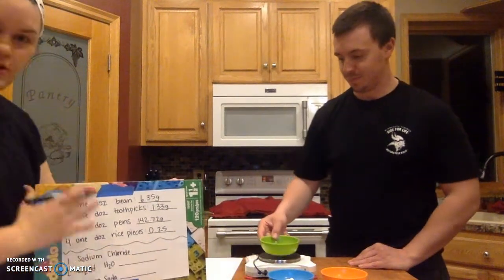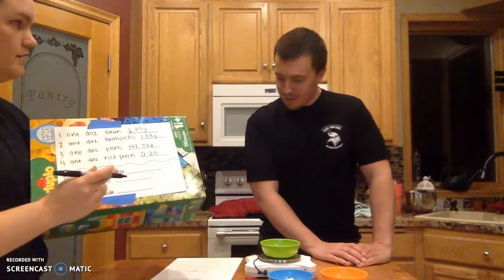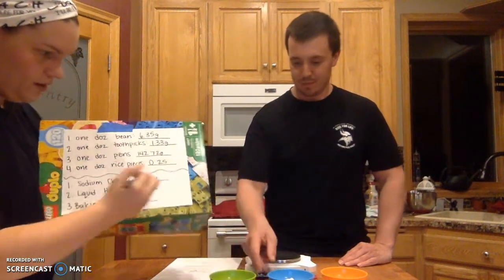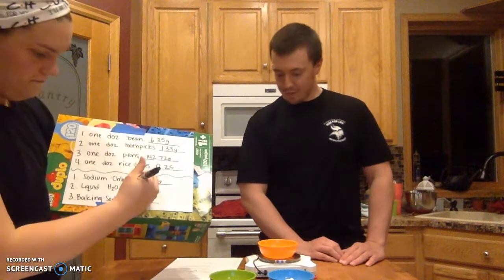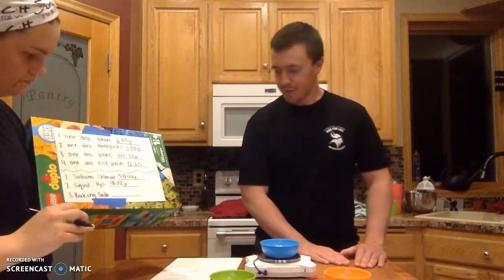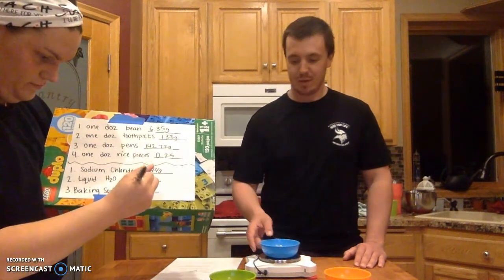So salt is sodium chloride. Okay. That is 58.44 grams. Okay, then you can switch to the water, please. The water is 18.02 grams. And the baking soda. The baking soda is 84.00 grams.